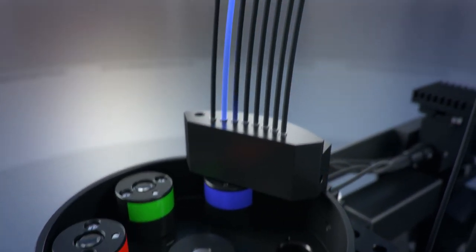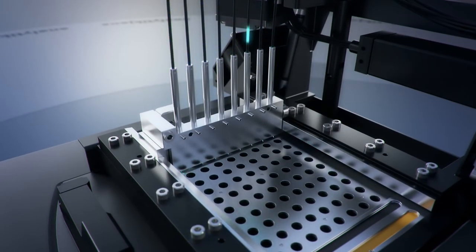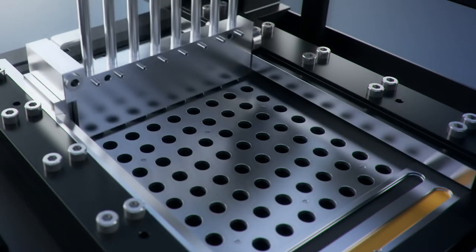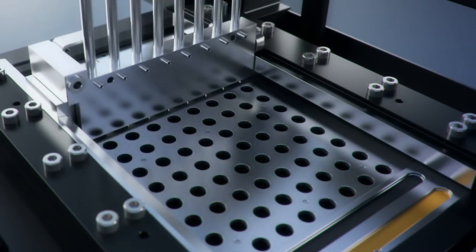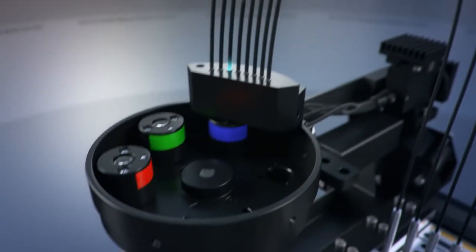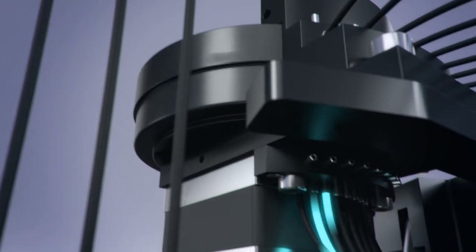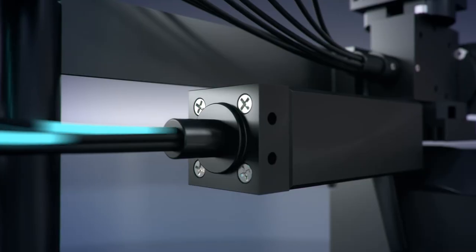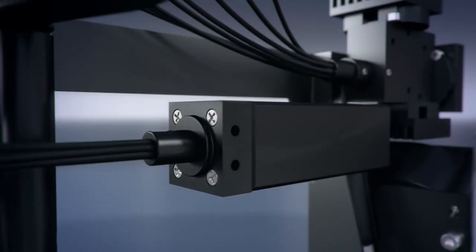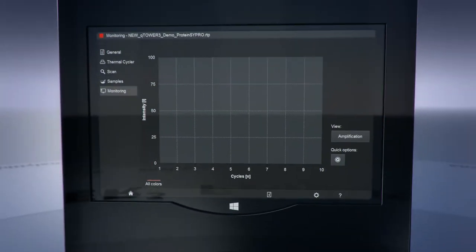Light fibers and an eight-position optical detection shuttle offer numerous advantages. Scan times are minimized to only six seconds regardless of the number of measured dyes. The single detection of each well renders the need of a passive reference unnecessary as edge effects are completely eliminated. Additionally, the highly sensitive detector is maintenance-free and requires no periodic calibration. Analytic Jena offers an industry-leading 10-year warranty on all high-performance optical system components, providing peace of mind for years to come.